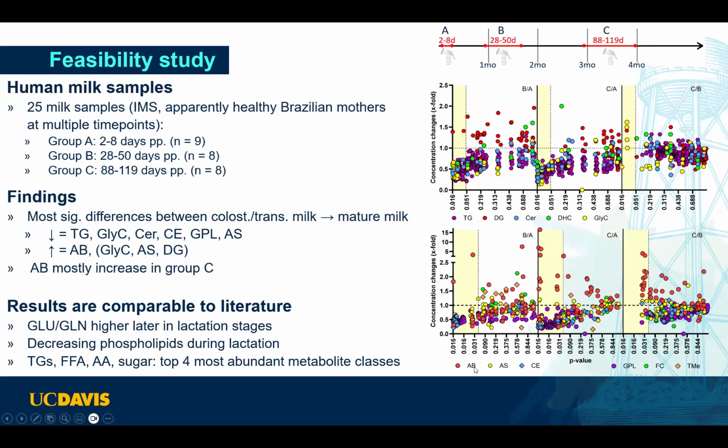And down here, we look at the amino acids, biogenic amines, and related acyl carnitine sphingomyelins in the yellow, the cholesterol esters, the phospholipids, lysophospholipid, fatty acids, and carboxylic acids, and then again those trace metabolites, where we have not many responses within class, those very little ones that didn't have many metabolites within class, again endos, hormones, and so on and so forth. So it's a longitudinal approach here just to see how changes occur.